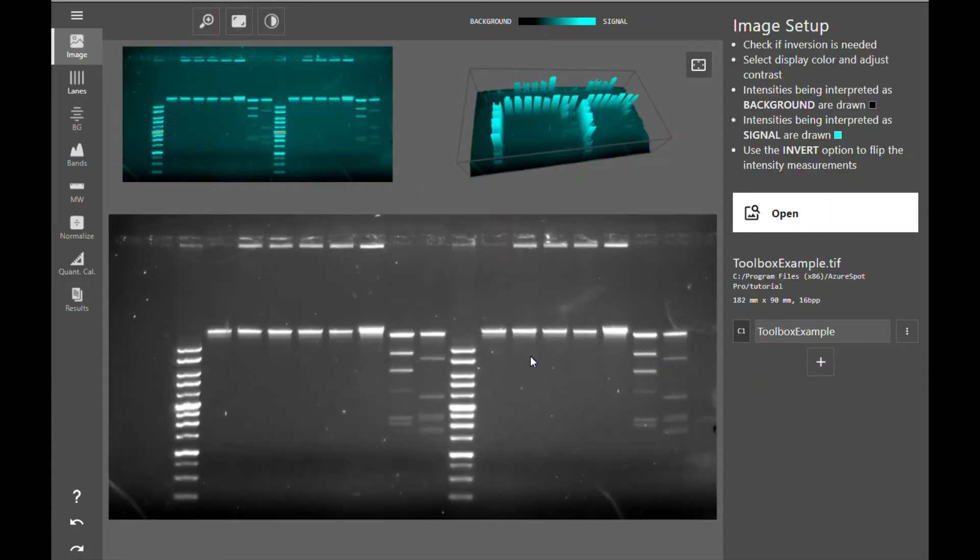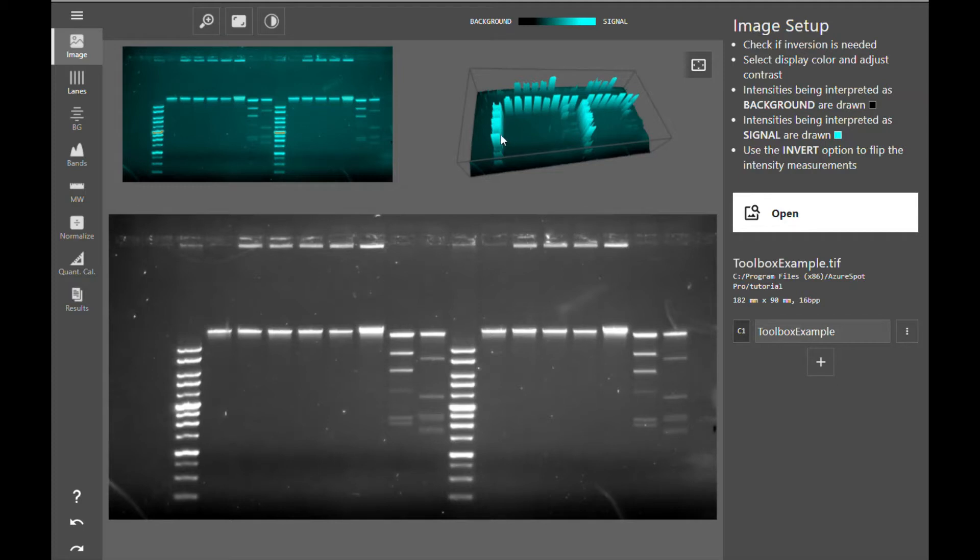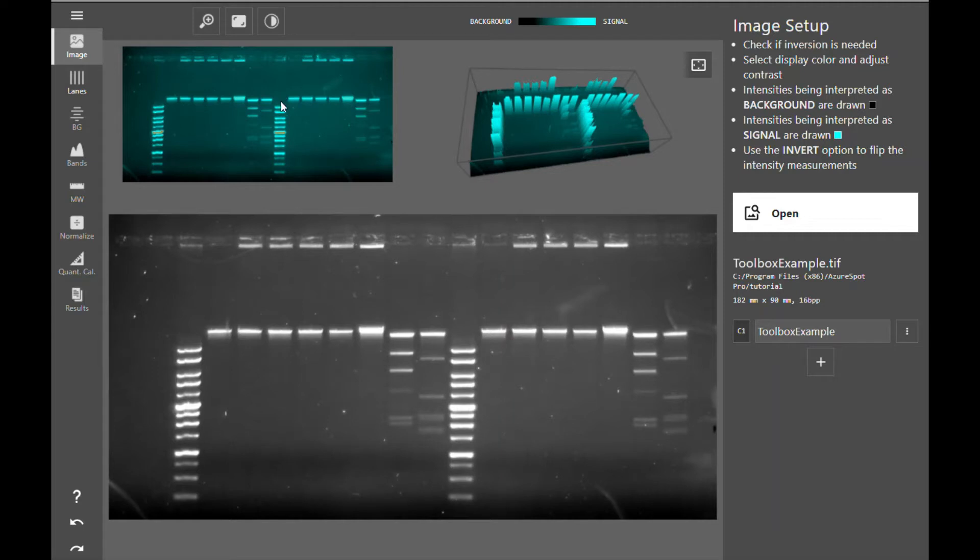As soon as the image is open, you will see these two cyan graphics at the top above your image. These two graphics display your signal in cyan and background in black. The graphic on the left will highlight saturated pixels in red. If all your pixels are in cyan, you're all good. Otherwise, if you see any red pixels, those pixels are saturated.